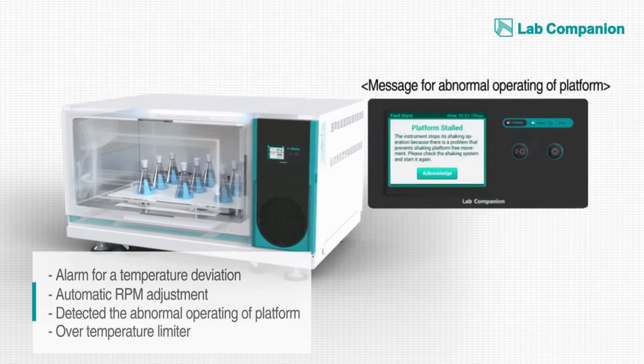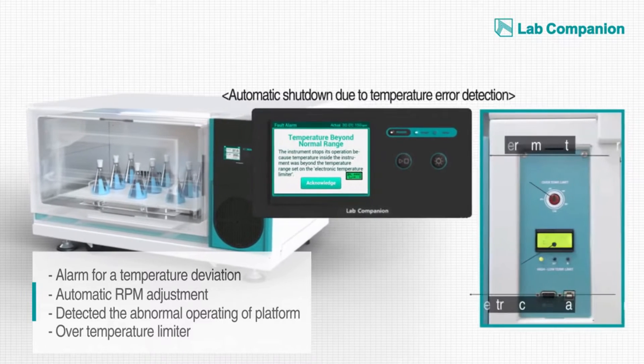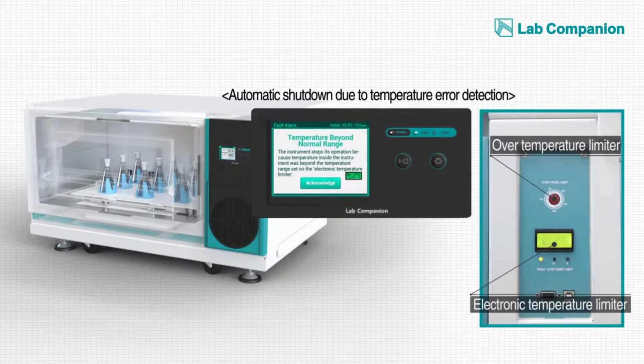Anytime the system senses abnormal conditions such as overheating and overcooling, it automatically stops the device and signals an alarm so that the safety of the sample and the device is constantly ensured.